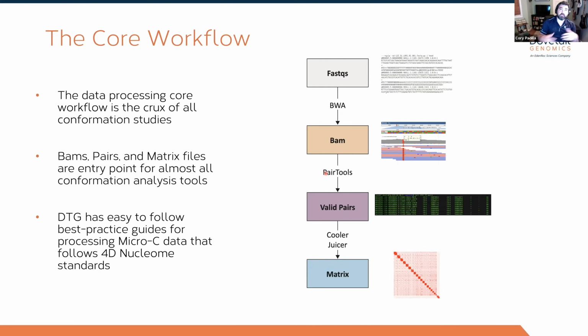If you've never done Hi-C work before, this is something that's going to be a little new. But essentially what this tool does is it distills your alignment into a text file that gives you the read name, the chromosome of read 1, and just the midpoint of read 1, the mapping chromosome of read 2, and just the midpoint of that mapping fragment.